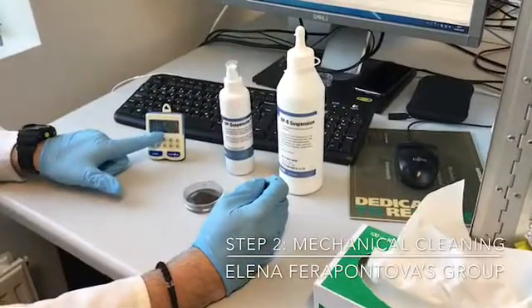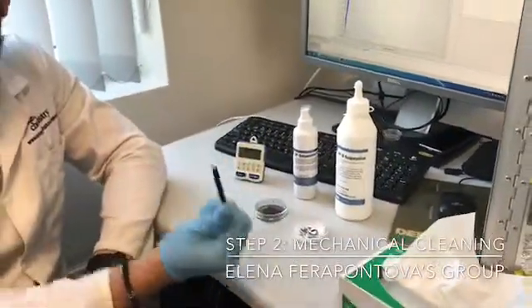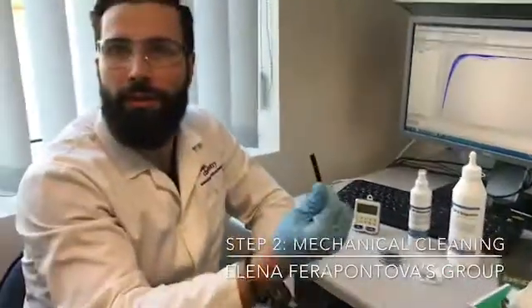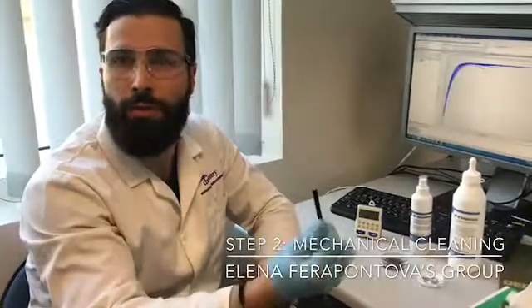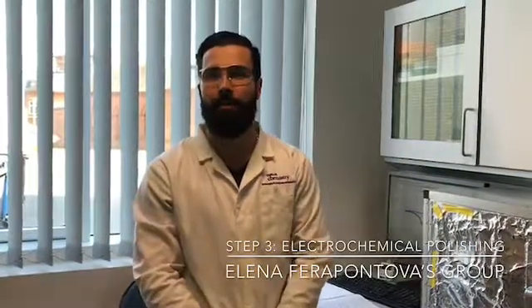Again, do it for two more minutes. After the mechanical polishing, you sonicate the electrode in ethanol and water in a one-to-one ratio, at least for 10 minutes. So we have arrived at step number three — this is the electrochemical polishing.